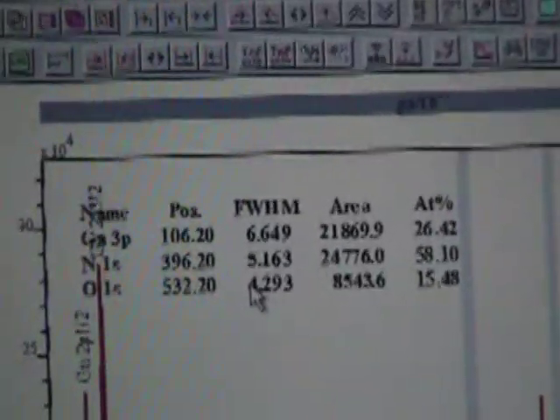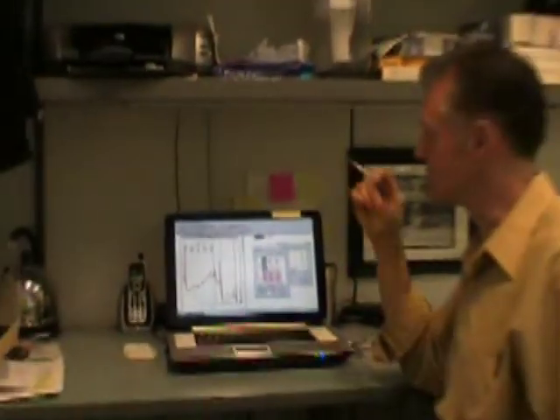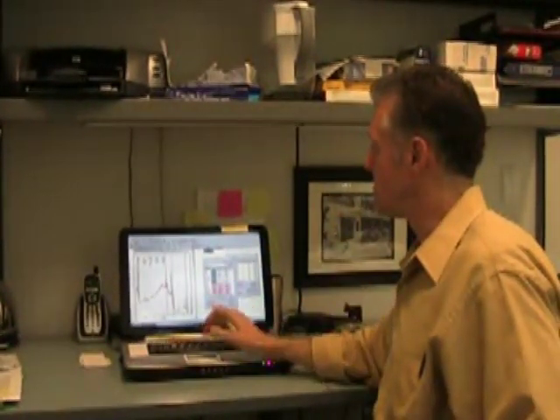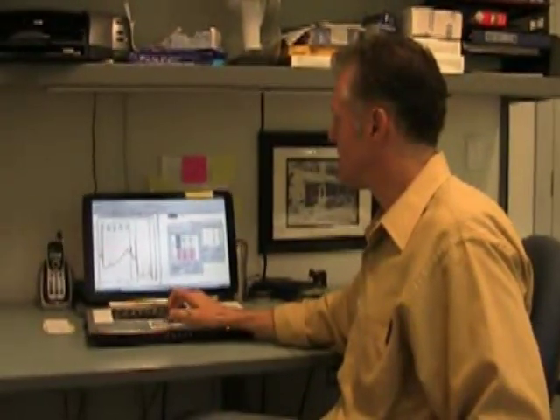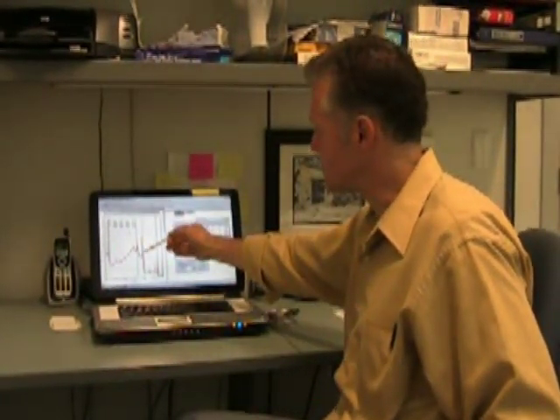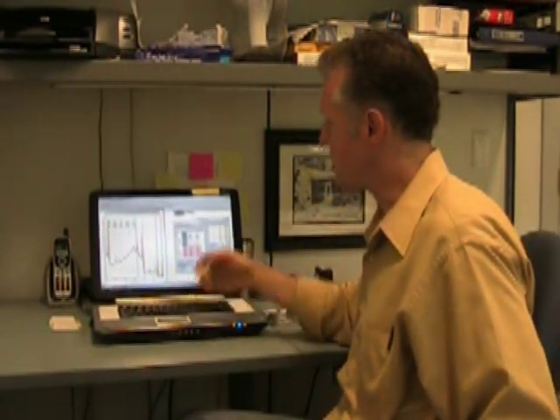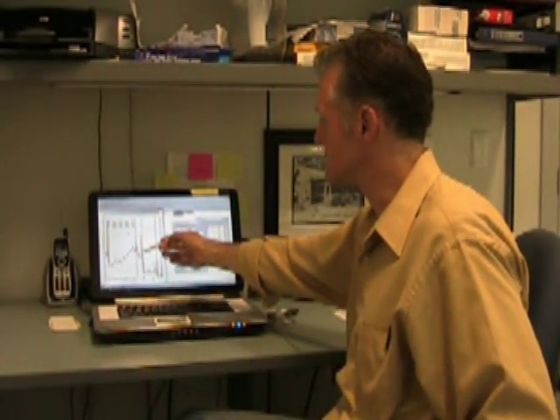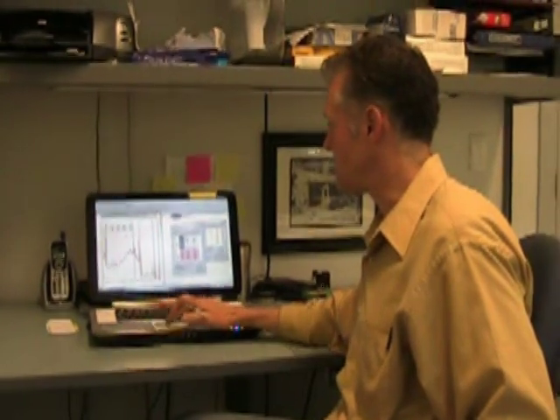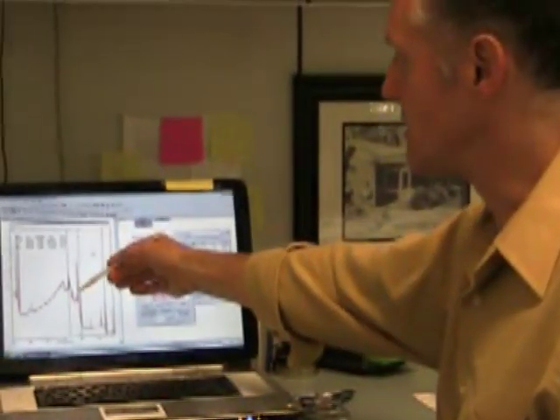So in other words we have more than twice as many nitrogens as we do galliums. And on the surface of things that would seem to be a big problem because it's supposed to be gallium nitride, the formula for which is GaN. In other words there should be the same amount of gallium and nitrogen atoms. But again, as we said before, this nitrogen peak, so-called, here, is not all nitrogen.